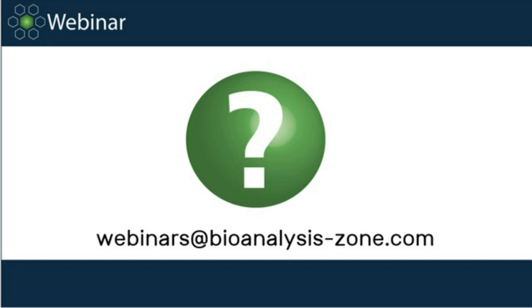But if my scientists come to me internally with this, what I recommend to them are the following, maybe a couple of approaches. I may suggest to just split the biomarkers that are problematic into its own series of a small multiplex or singleplex format, and then optimize it under appropriate MRD to remove and minimize the parallelism issue.